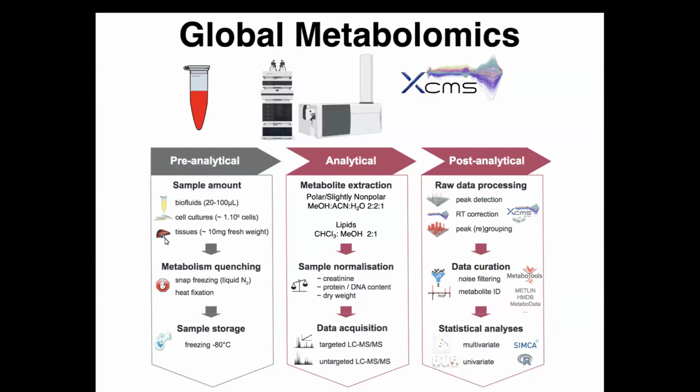The next step is to prioritize significant features. We use statistical p-value, fold change, and intensity cutoff. From this, we typically obtain hundreds to 1,000 significant features. The last step is searching the collected MS2 data against the METLIN database to identify the significant features.